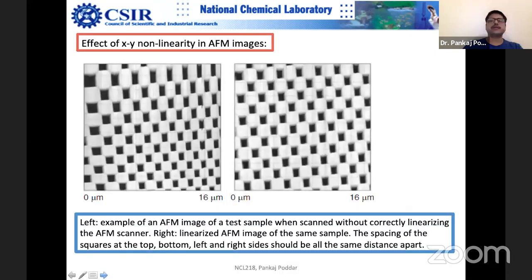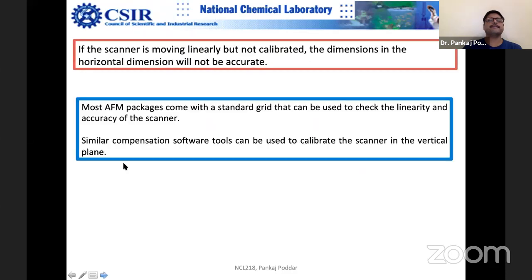Because of scanner XY nonlinearity, features may look narrower on one side of the image — this has to be fixed. You can see XY nonlinearity in test patterns where features look distorted. This is essentially a test pattern — when you buy an AFM, you often get free test samples. Most AFM packages come with a standard grid that can be used to check linearity and accuracy. This calibration should be done once per year or once every six months depending on usage.